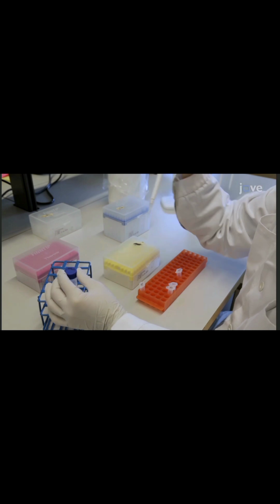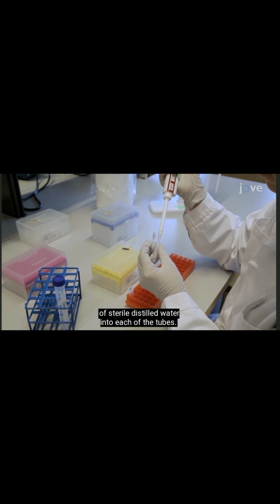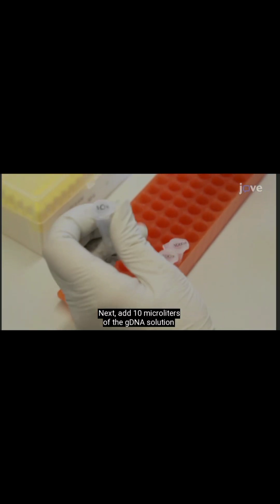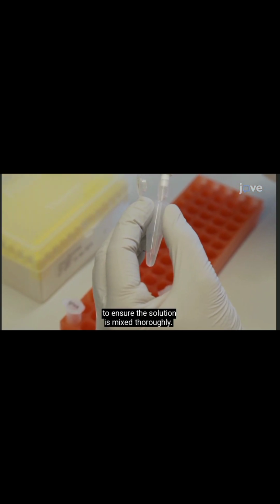Then use a pipette to dispense 90 microliters of sterile distilled water into each of the tubes. Next, add 10 microliters of the gDNA solution to the 10x tube. Pipette the whole volume up and down to ensure the solution is mixed thoroughly.